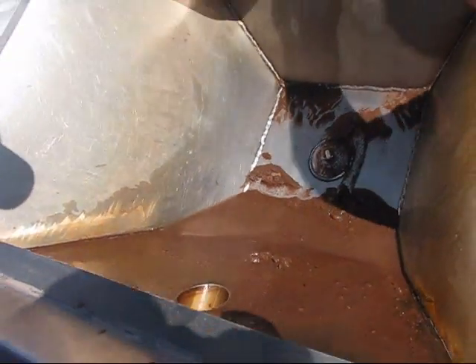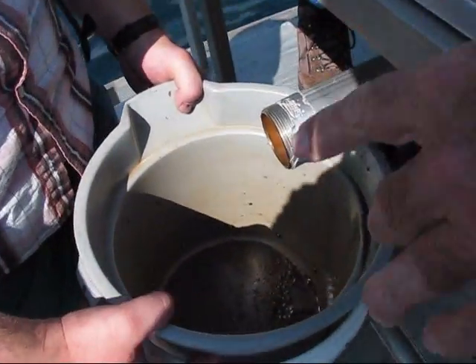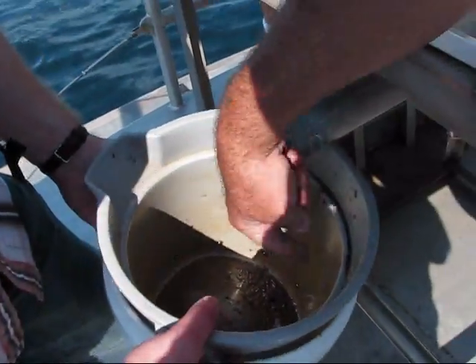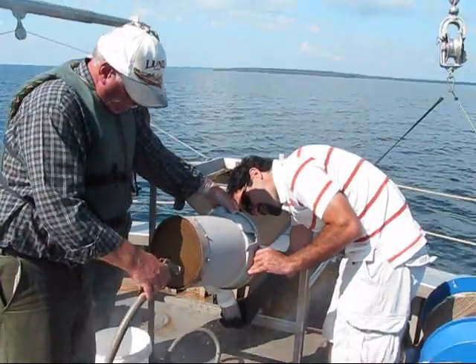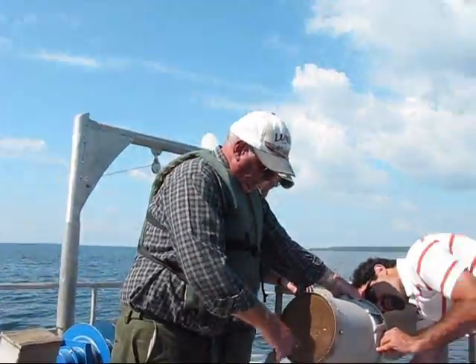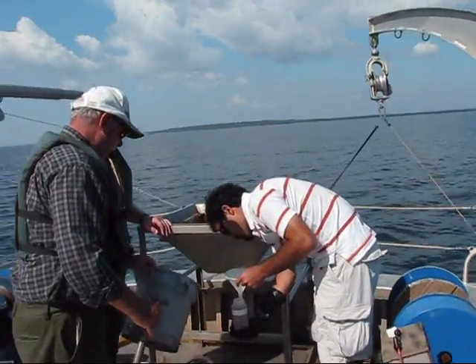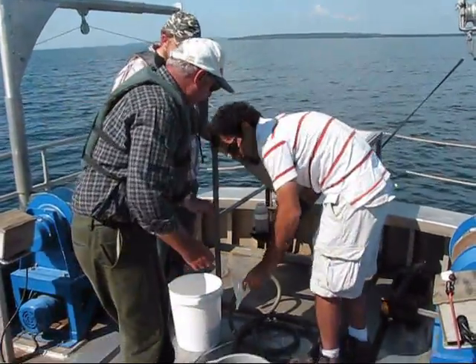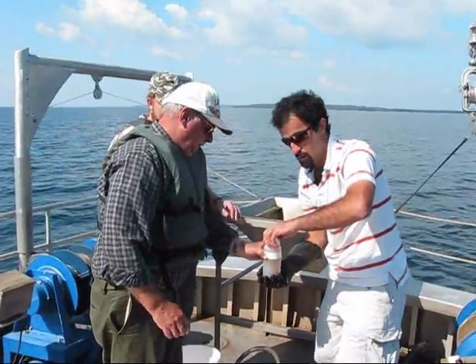So you set this back down. And then you take this bucket and your hose and you rinse out the sand. Put it up and level in the bottom. Yeah, we're low. Okay. Now that had formalin in it, right? Yes. Okay. That's it.